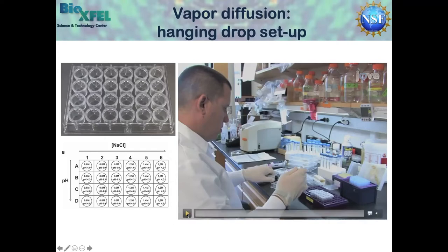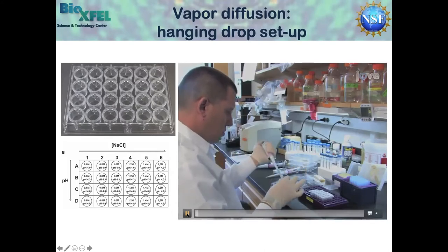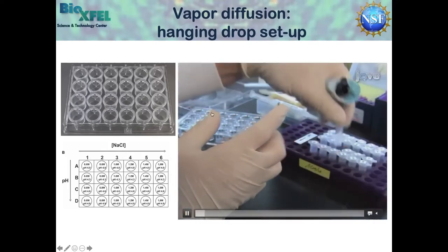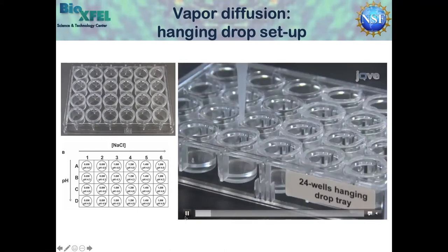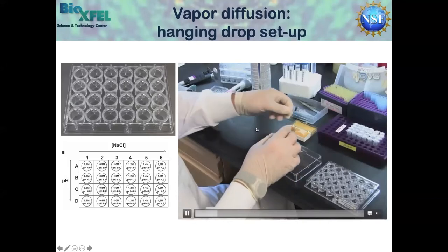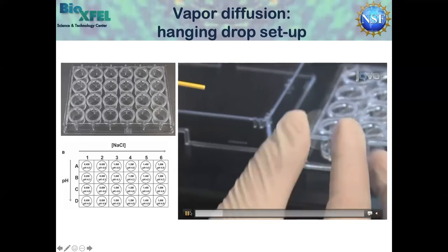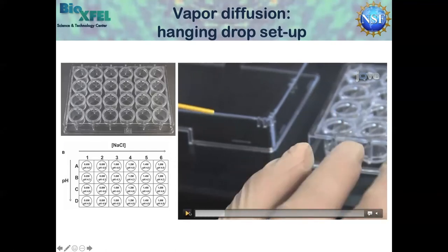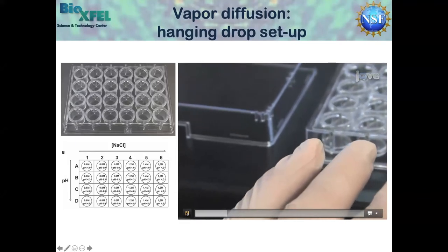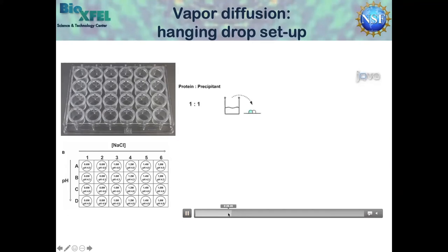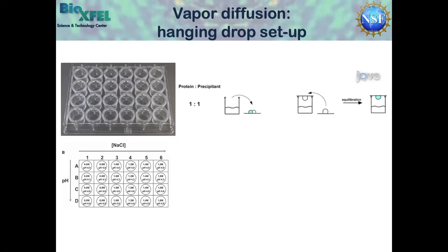I'll narrate this video since we can't do this in person. The scientist has already prepared all the individual solutions required for their tray and is now filling the reservoir solution, which sits at the bottom of the well. Now they're pre-greasing the wells with silicon grease — you want to do it in such a way that you leave an opening for air escape when you seal it. Here are the cover slips — these are probably the 18 millimeter ones. They're using an air can to dust off any particulates or contaminants that might interfere with your crystallization experiment, because it can be disheartening if you look at your tray, think you have a hit, and it turns out to be a fiber contaminating it.